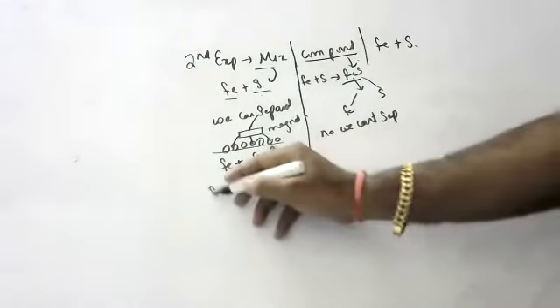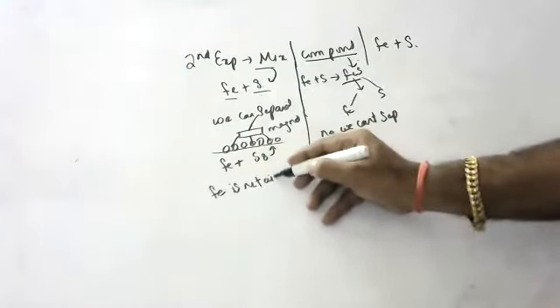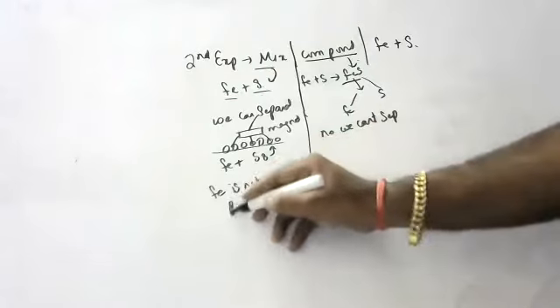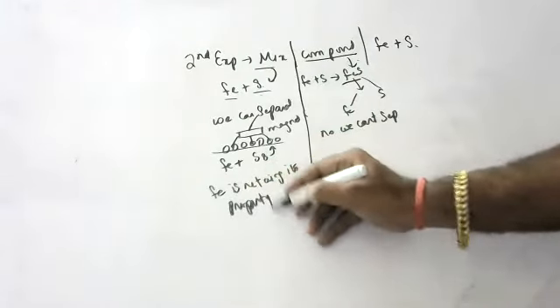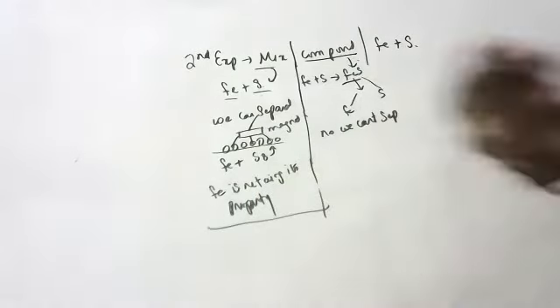Here, iron is retaining its property in the mixture. Why is it retaining its property? Because it is in elemental form. It did not form any new compound.